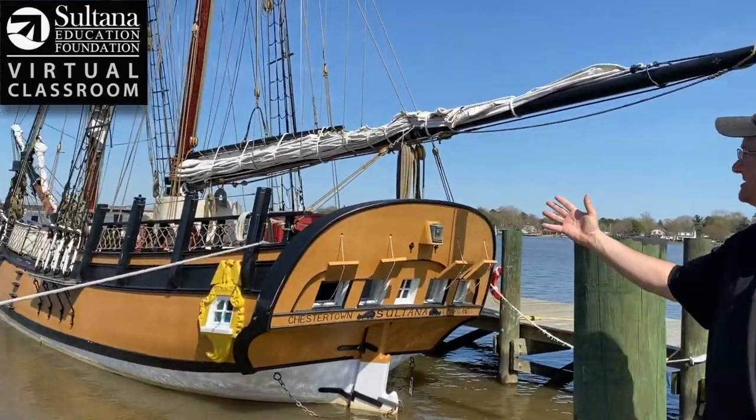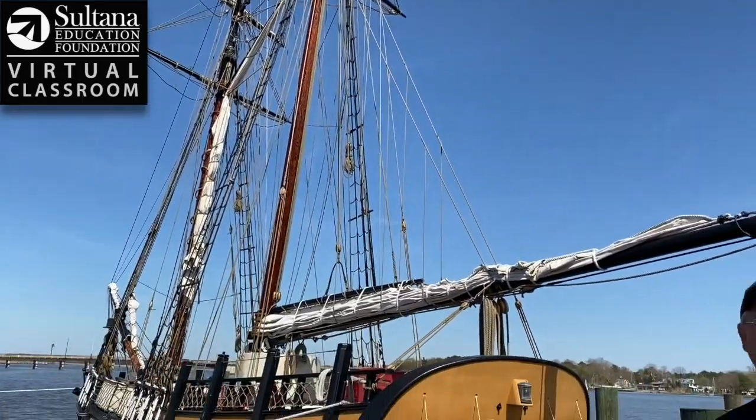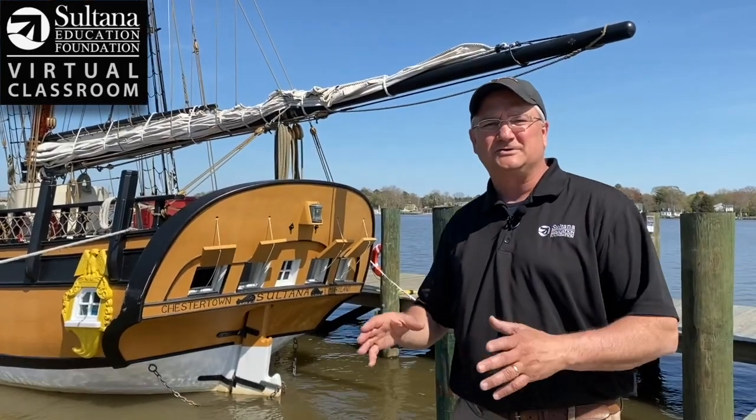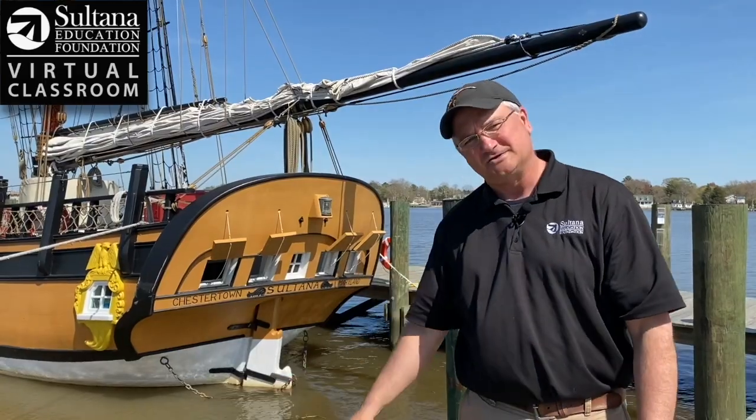Hey everybody, Chris Serino here for Sultana Education Foundation's virtual classroom. I'm here on the Chester River in the beautiful colonial port of Chestertown. You can see behind me the 1768 reproduction of the schooner Sultana, and today on this video we're going to be talking about how to conduct a test to monitor the dissolved oxygen levels right here in the Chester River.